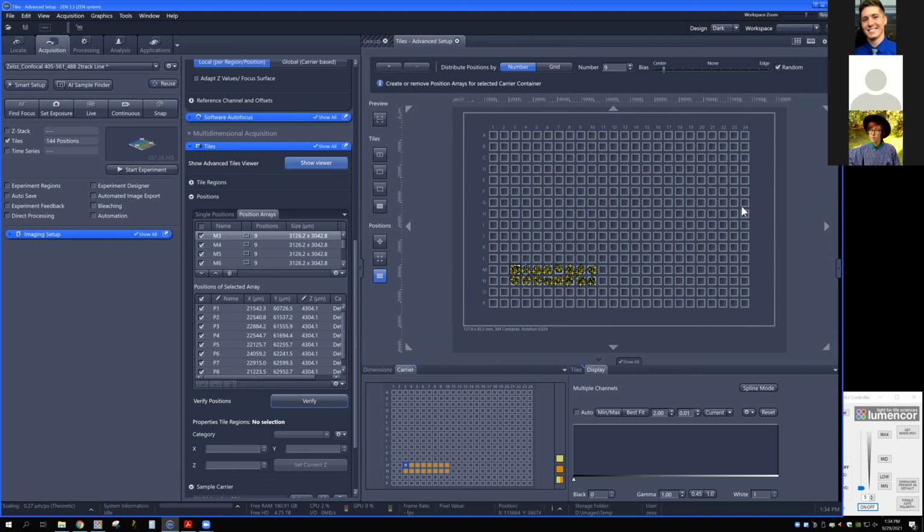That is the space between the objective and the focal point, or your sample, including the cover slip. So you don't necessarily have a lot of room to move before you bump into it with these higher mag objectives. And not only that, the top surface of the objective is relatively flat for many of these objectives. The 63 especially has a very shallow front piece.